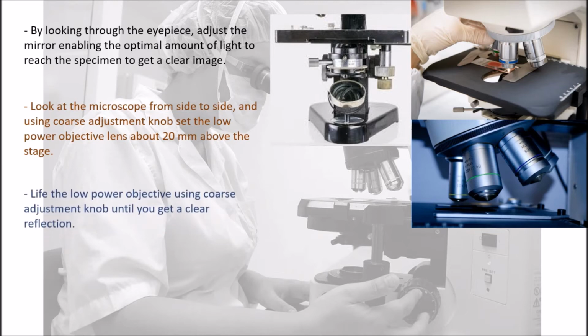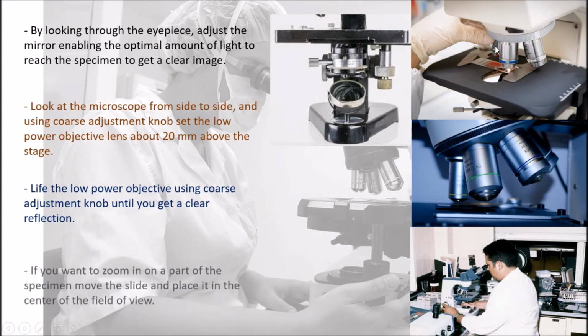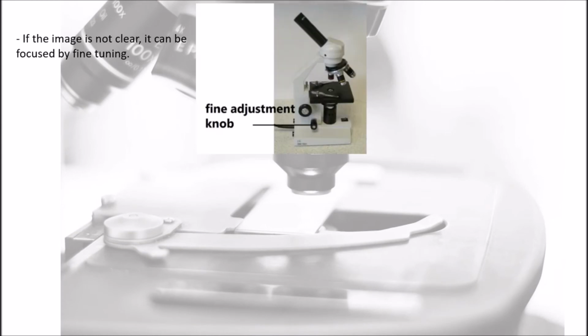Lift the low power objective lens using the coarse adjustment knob until you get a clear reflection. If you want to zoom in on a part of the specimen, move the slide and place it in the center of the field of view. If the image is not clear, it can be focused by fine-tuning.